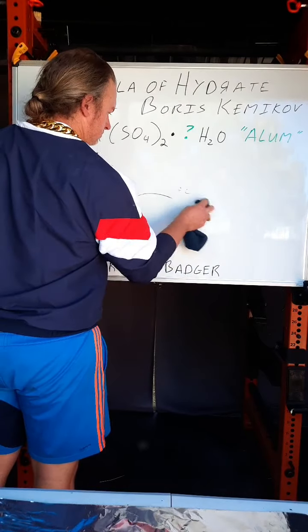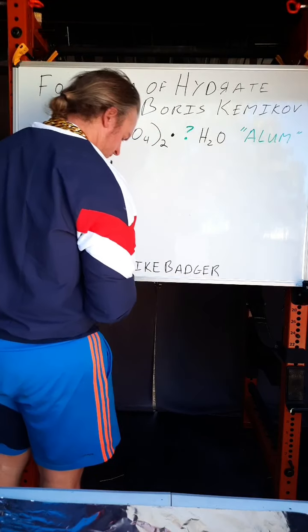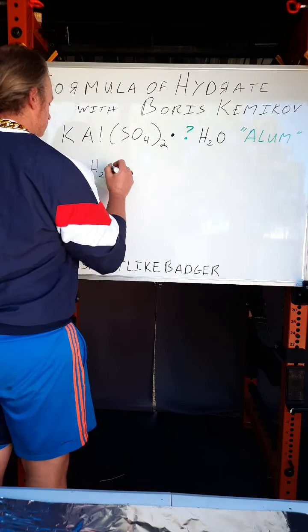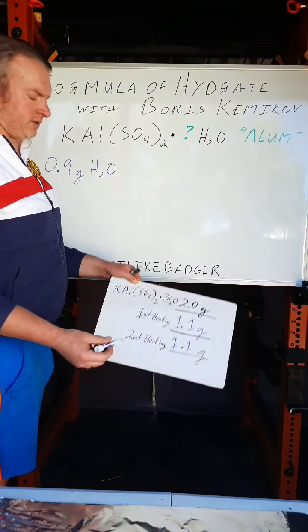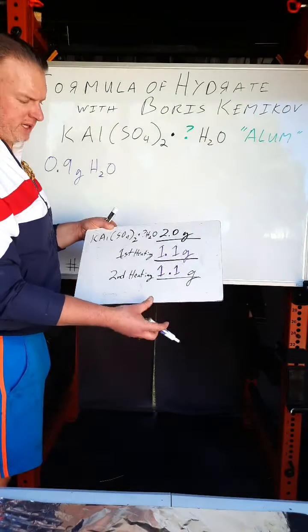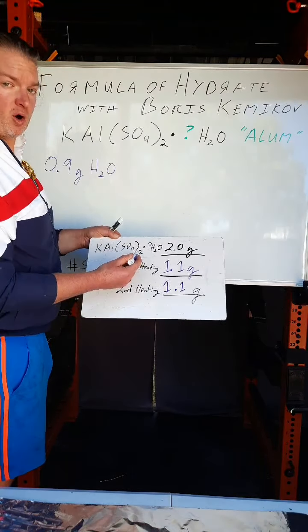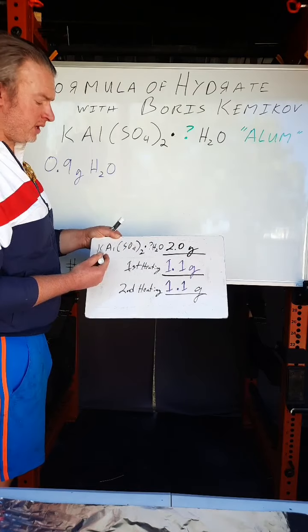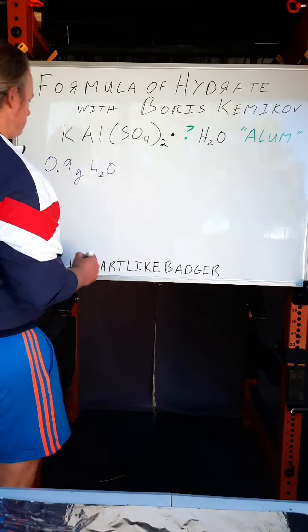Boris erase cartoon. And the 1.1 gram remaining, that was the dry or anhydrous potassium aluminum sulfate.